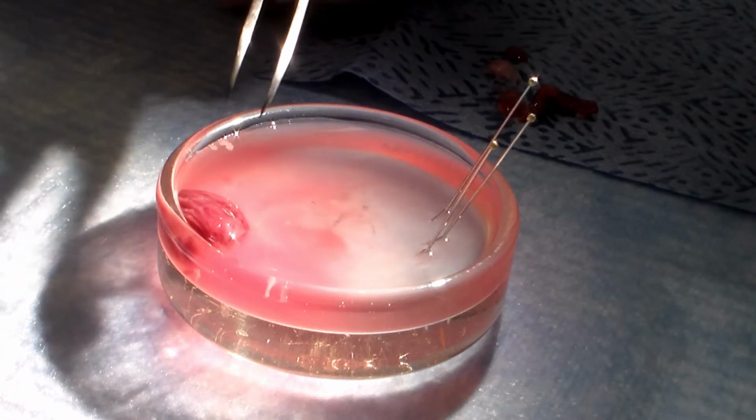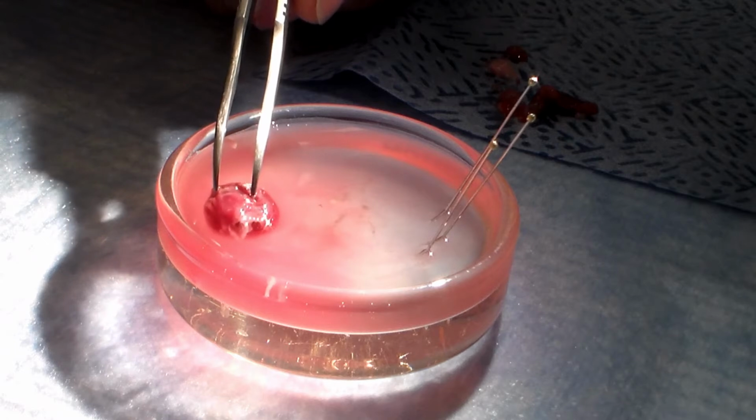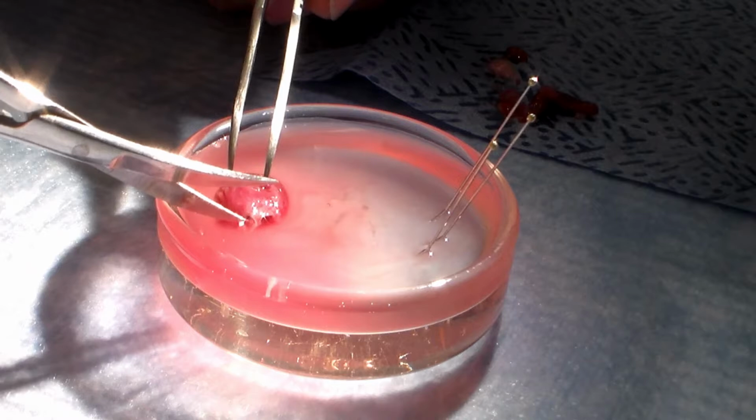Once the right ventricular wall has been trimmed away, a cut is made down the center of the septum, from the base to the apex.